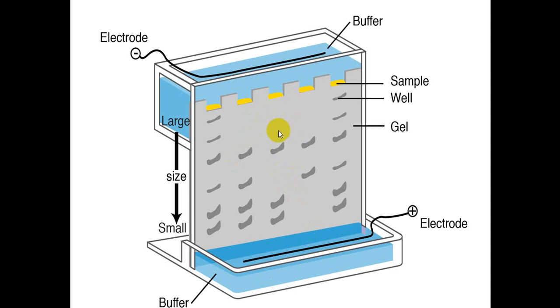This is polyacrylamide gel because it is a very strong synthetic gel which is very robust, and most of the time it has a small pore size. That is what is used in the chemical industries and other places, and it is very mutagenic. Mutagenic means that it causes cancer, mutation of the DNA. Very mutagenic. So often when it is used, safety precautions have to be strictly adhered to.